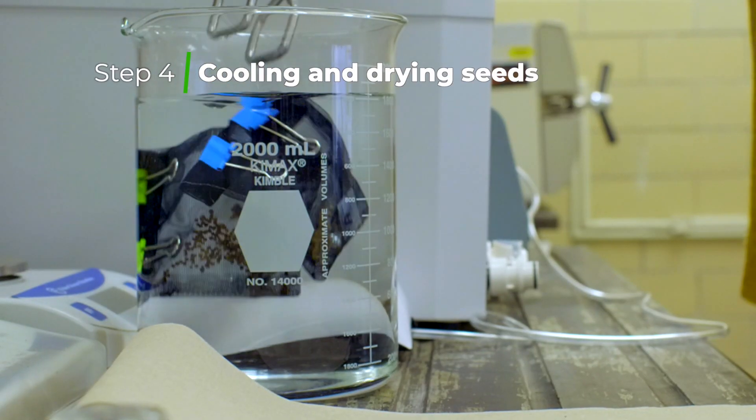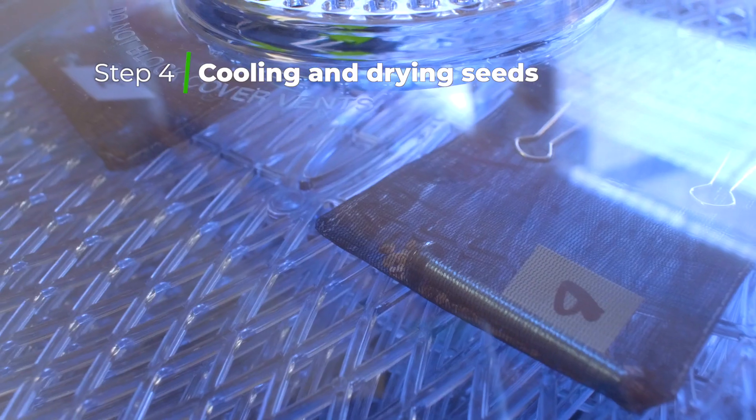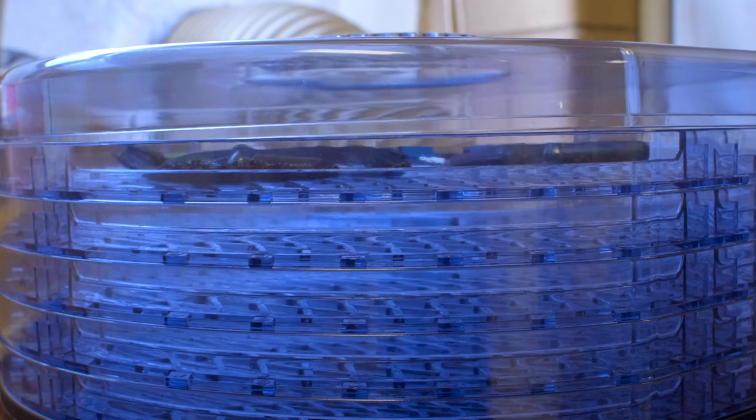When the treatment is complete, we dunk the seeds in cold water to cool them down quickly, blot them dry, and then place them in a fan-only dryer overnight. Using a dryer helps seeds dry more thoroughly and reduces the risk of seed germination.